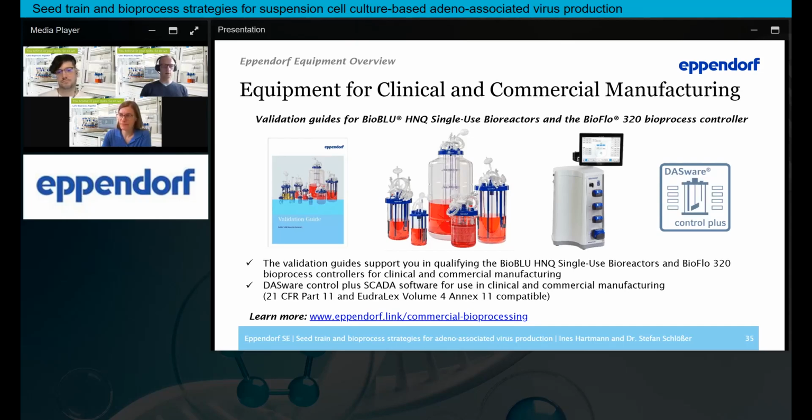All right, let's go to the last question that I can see here, and this is also bioprocess related. The question is, are there other options to monitor your process than directly on the bioprocess controller in the lab? Stefan. Actually, there are. I didn't mention this directly, but of course, you can always go into your lab and check how the process is running on the screen of your bioprocess controller.